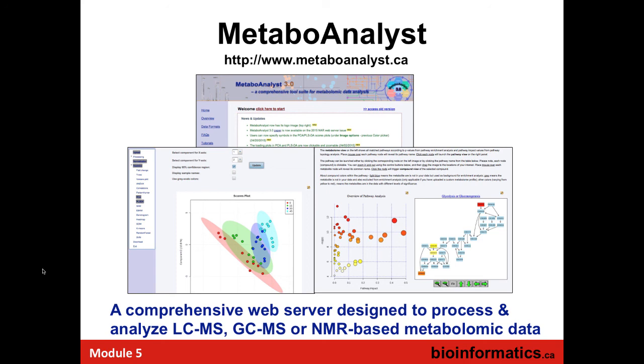So just for context, MetaboAnalyst is actually the most widely used analytical tool for metabolomics. It has, I think, an average of 6,000 or 7,000 users per day, every day. Roughly a third of all papers published in the field of metabolomics use MetaboAnalyst. So it was developed by Jeff while he was in my lab, and now he's continuing to develop it in his lab at McGill.